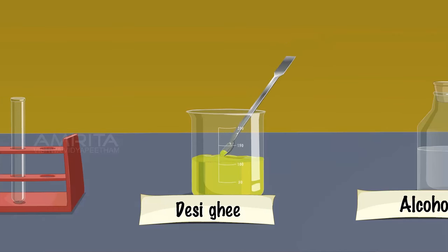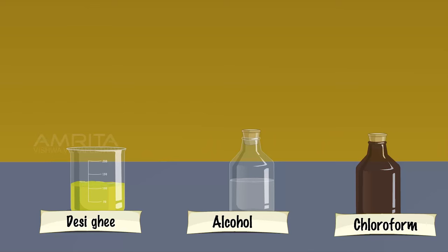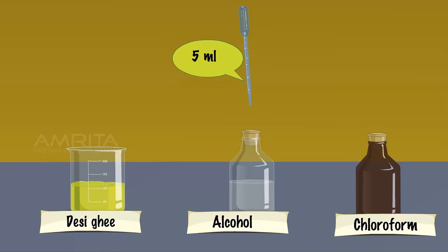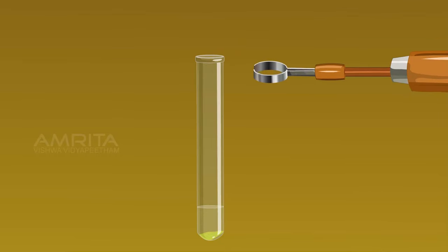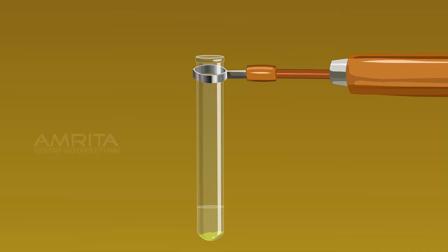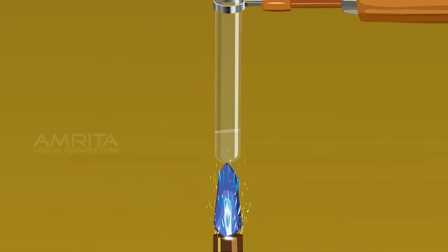Now take a small amount of desi ghee in another test tube. Using another dropper, take about 5 ml of alcohol and add it into the test tube containing desi ghee. Desi ghee forms a lower layer. Hold the test tube with the test tube holder and heat it over the Bunsen burner. The lower layer of ghee dissolves on heating.